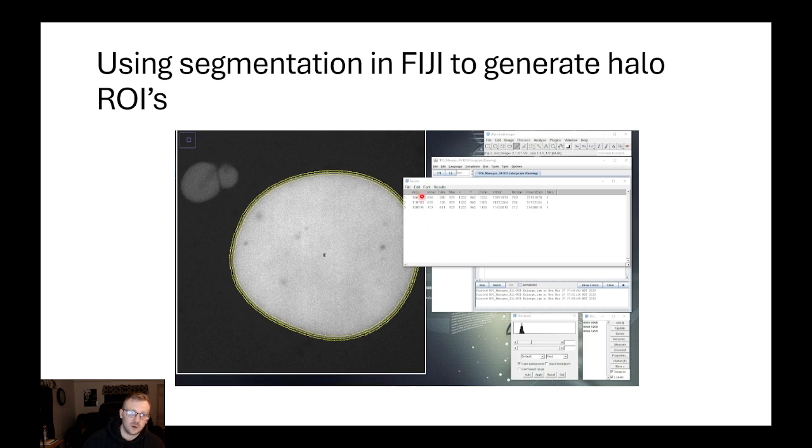One, it told me the area of the nucleus I'm looking at of all those ROIs. It told me the mean pixel value of that intensity value inside of the nucleus. It told me the dimmest pixel, right, that minimum. It told me the brightest pixel and that maximum value. It told me what the perimeter of my region of interest was. This integrated density here, this corresponds to the image histogram we looked at earlier, where it's telling me the brightness associated of that protein of interest that's inside of there.